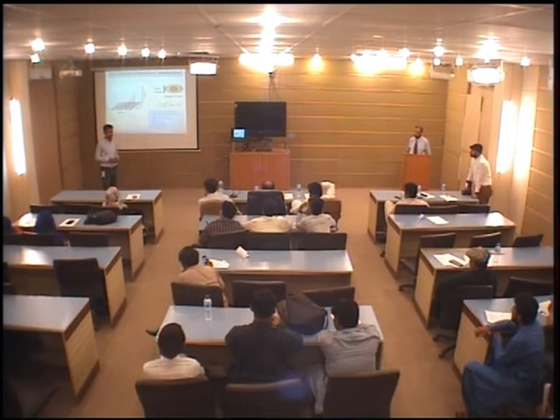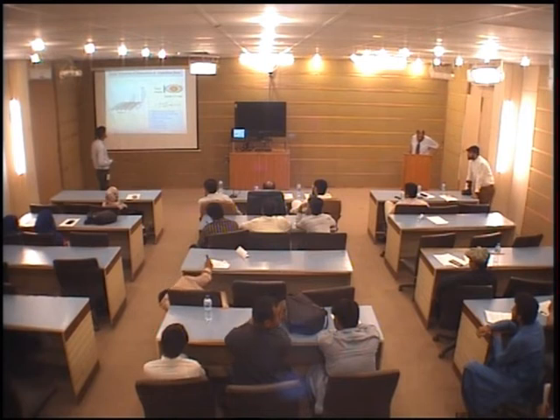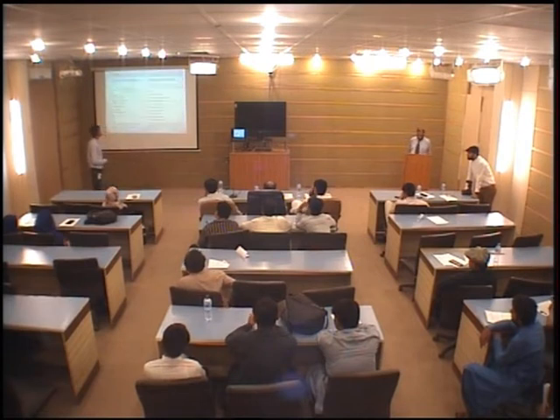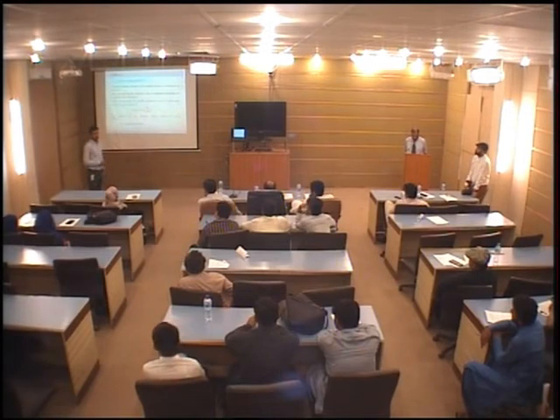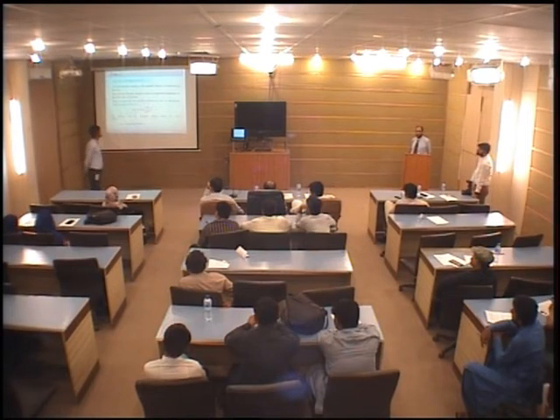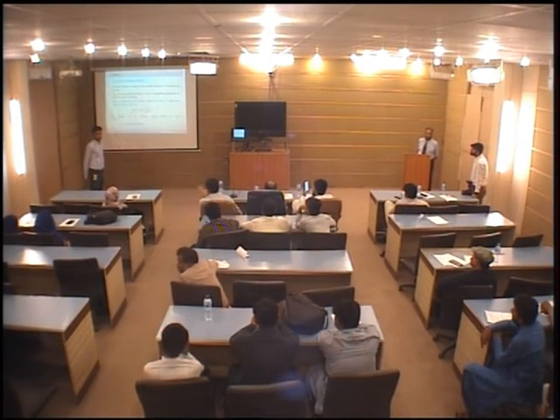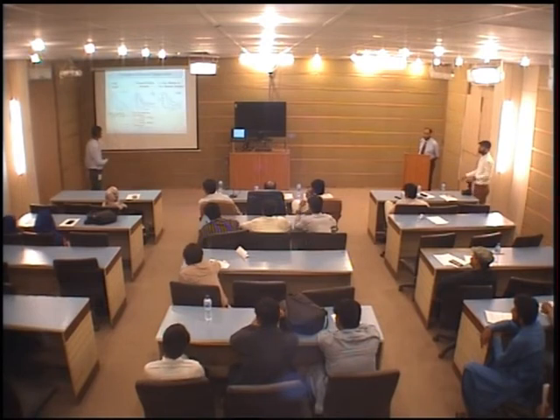So you said total number density of the neutrals. Total number density, again, how is it calculated? We have calculated it using this equation. Which one? This one. Okay. So you know this delta lambda half, and you know omega, and then you find the density. And where did you get this delta lambda half? From the experiment. Okay.